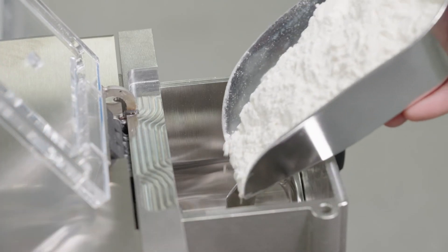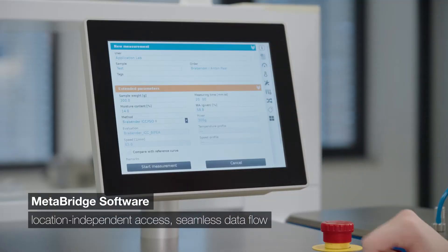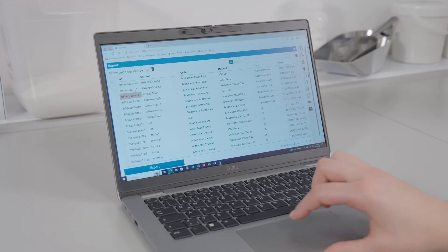Dive into the future of flour analysis with our newest generation of Farinograph, featuring MetaBridge. Premium instrument meets ingenious software. MetaBridge grants you data access from anywhere, at any time, connecting Brabender instruments for seamless data flow.